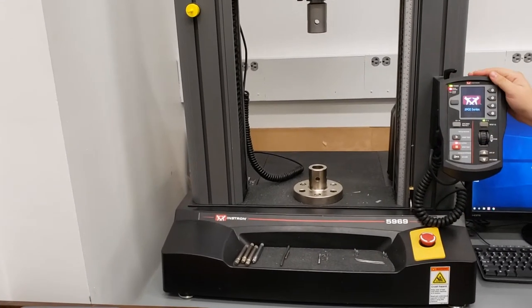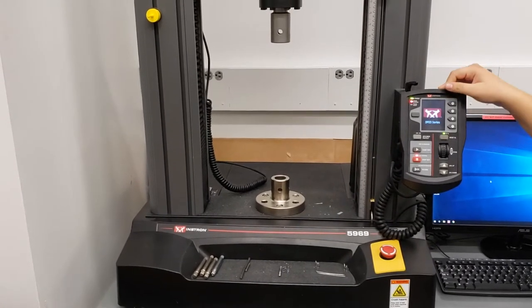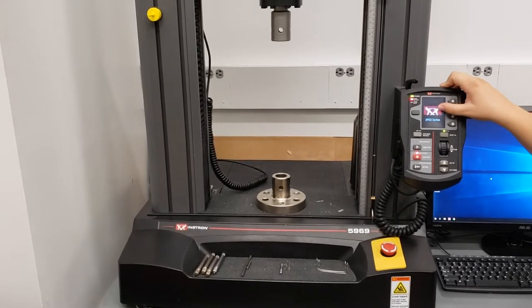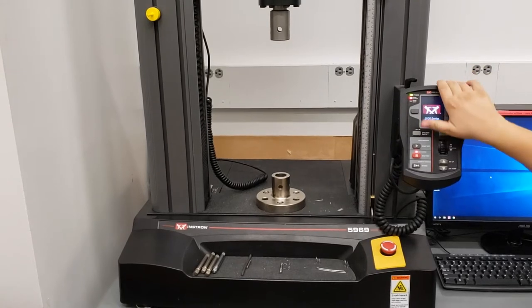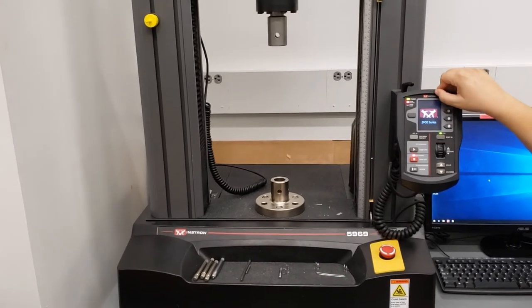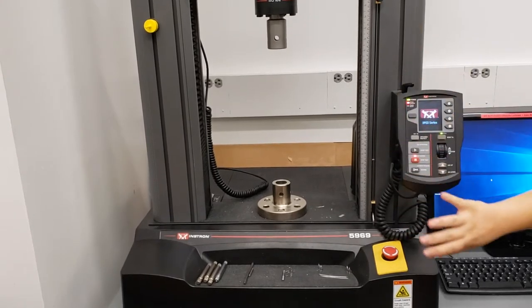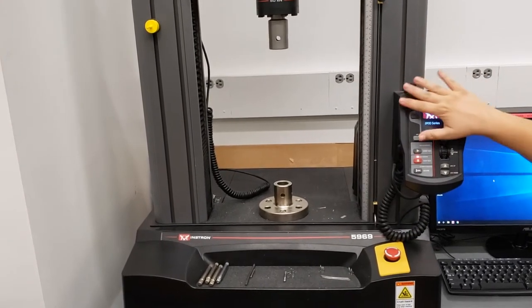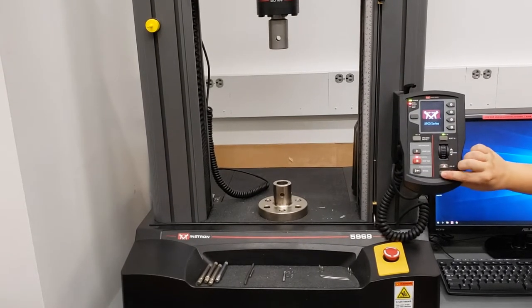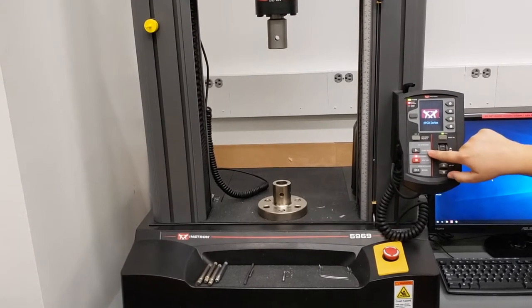We also have right here a console, which when the software is turned on will tell you information like what the crosshead location is and what the load cell is reading for the load on your sample. This is also how we control the movement of the crosshead, to move it up or down as we need to attach different accessories or fixtures onto the machine itself. When the software is closed, the up and down arrows are not going to do anything, and obviously you can't start a test if the software is off.